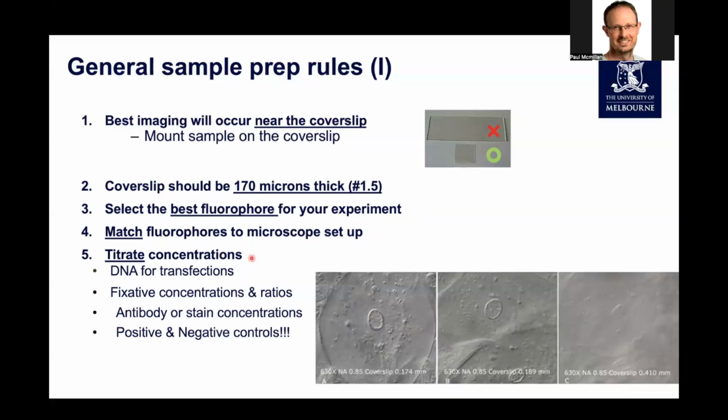One thing I'm always keen for our researchers to do is to titrate the concentrations. So just because you buy a dye from a vendor and it says to use it at a set concentration, that's not always the optimal thing to do for your sample. So I would strongly suggest that you try and optimize that as much as possible.